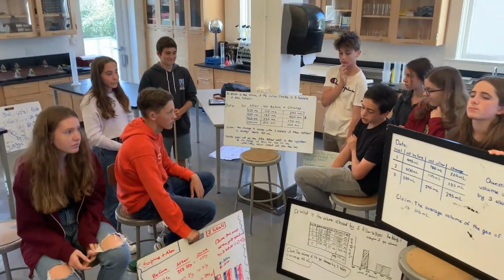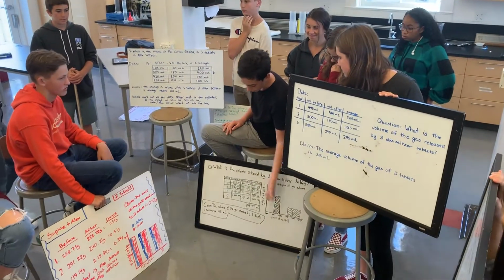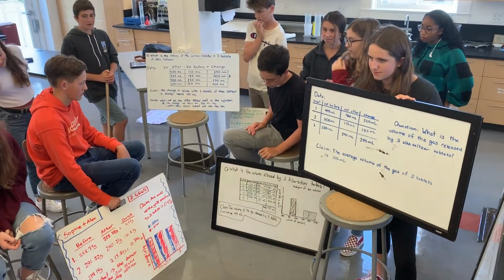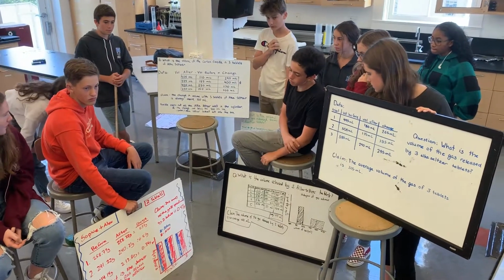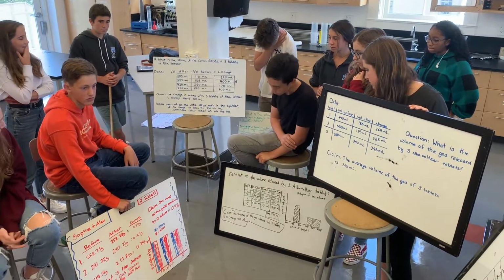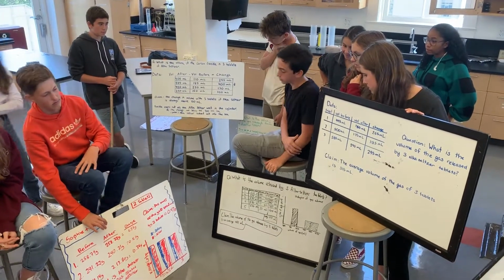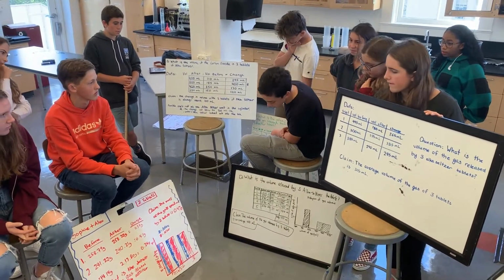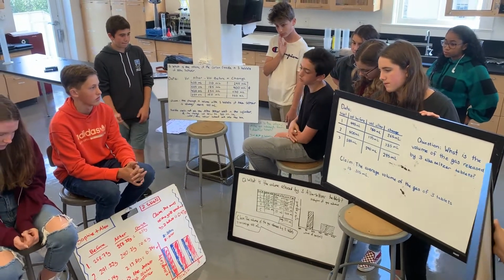Okay. We also had 3. At our table, we averaged around 441 milliliters of gas released for the volume, and I think we had some error.